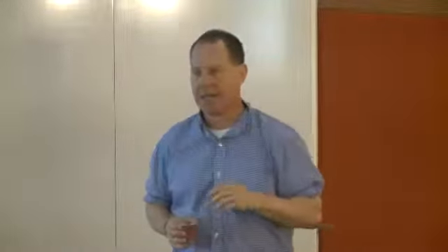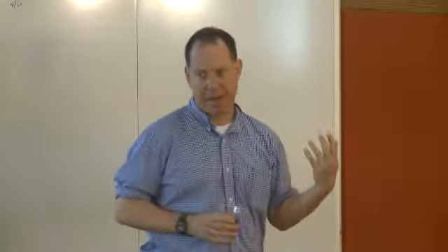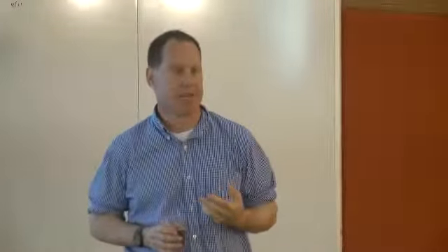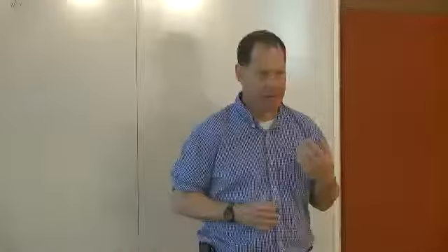I'm going to have maybe one slide that shows ChIP-Seq data, and then Noam will pick it up and talk about how to go from having a ChIP-Seq library to having analyzable ChIP-Seq data, and talk about the significance of ChIP-Seq, the kinds of things we discovered.